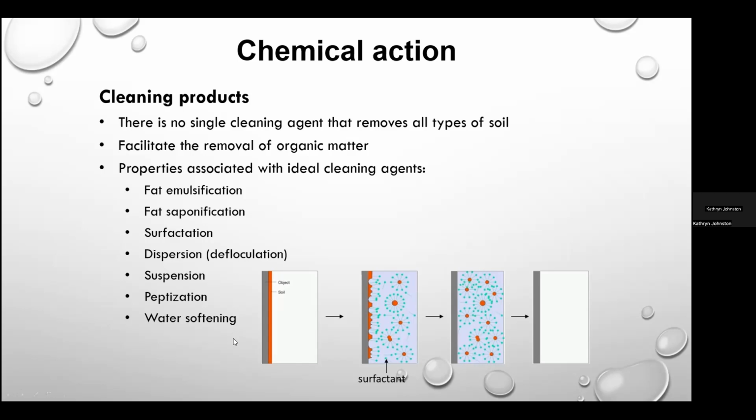And unlike hard water, softened water will not form insoluble scale, and it doesn't precipitate in pipes or interfere with cleaners such as soaps. So if you have scale forming on your glassware or such, then you know that means that you have hard water, and that could impact what's happening with your chemicals.